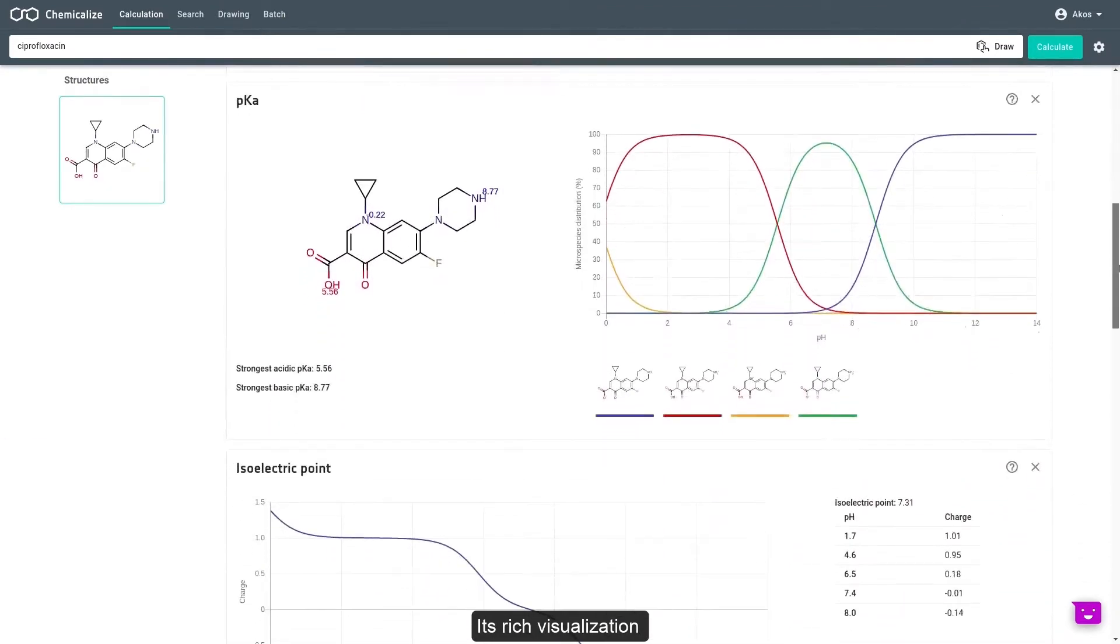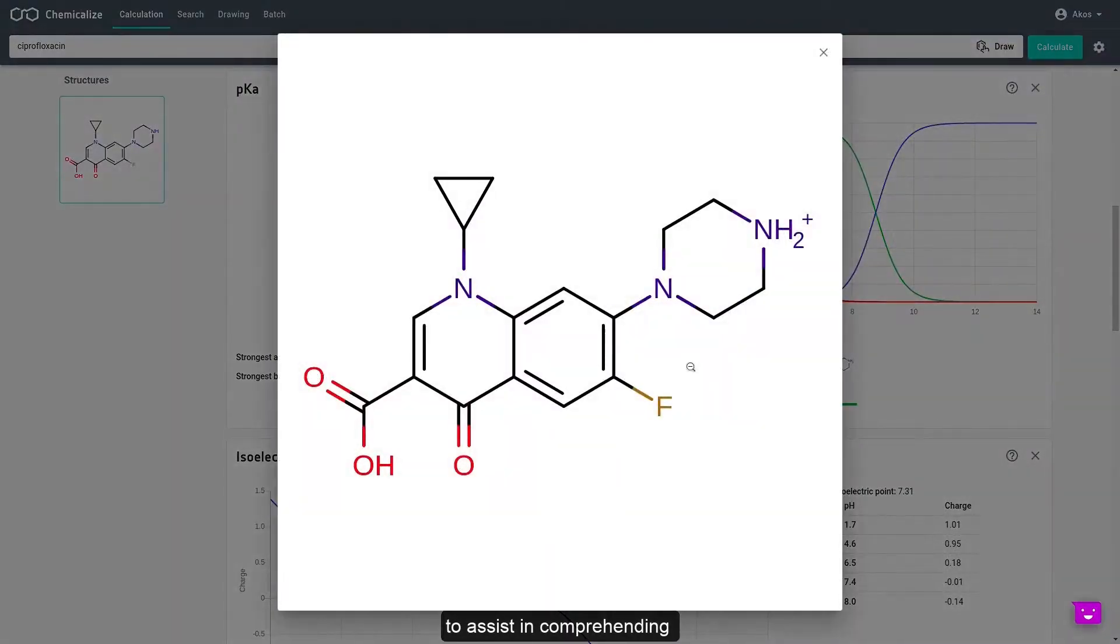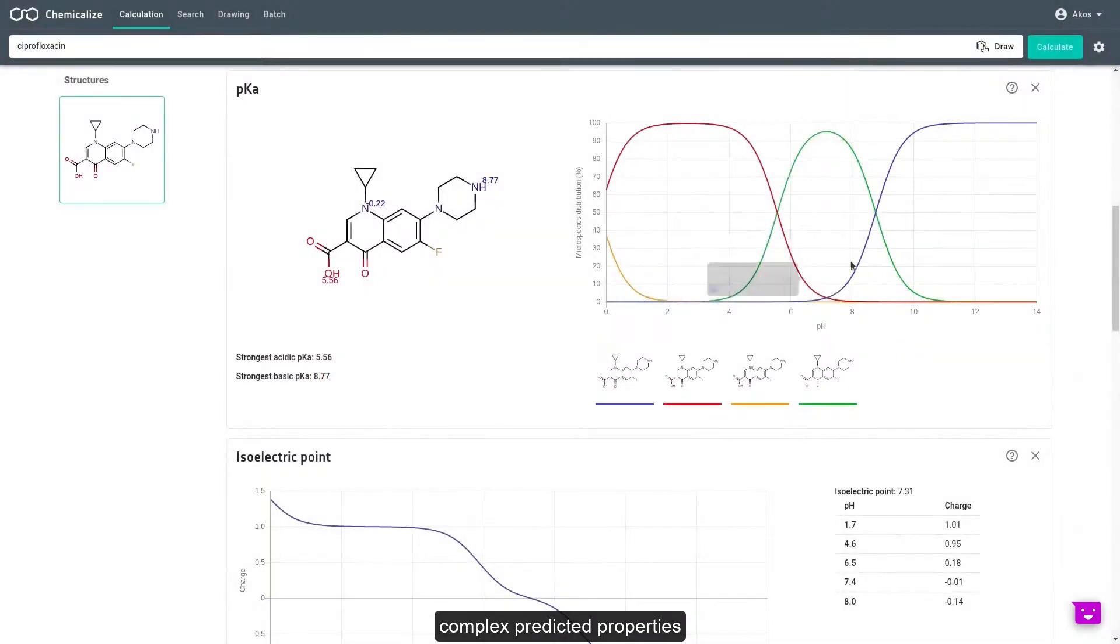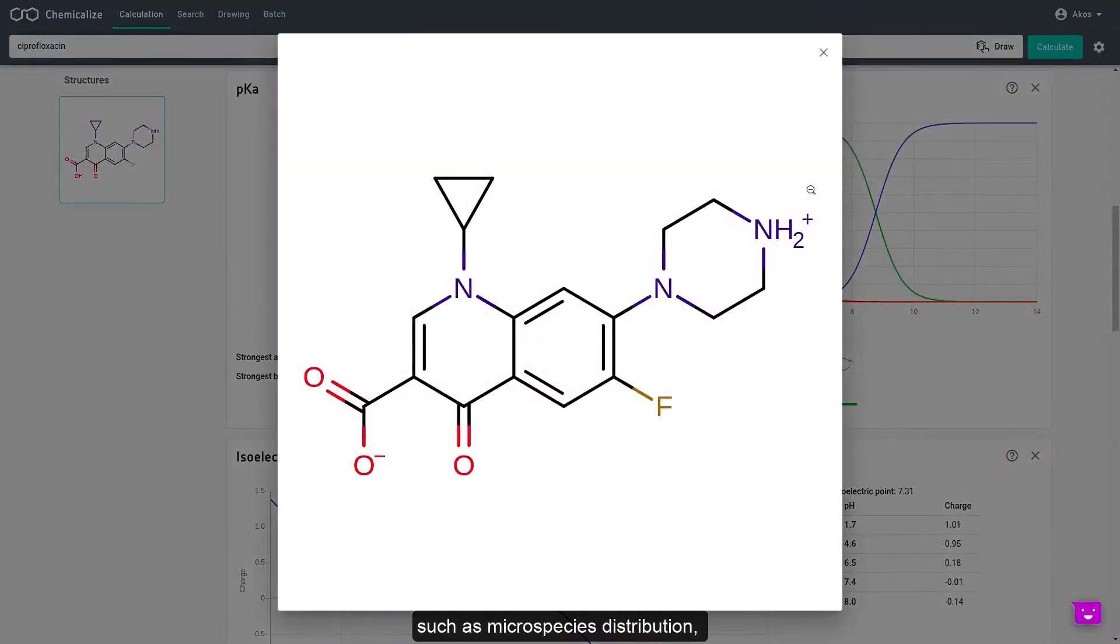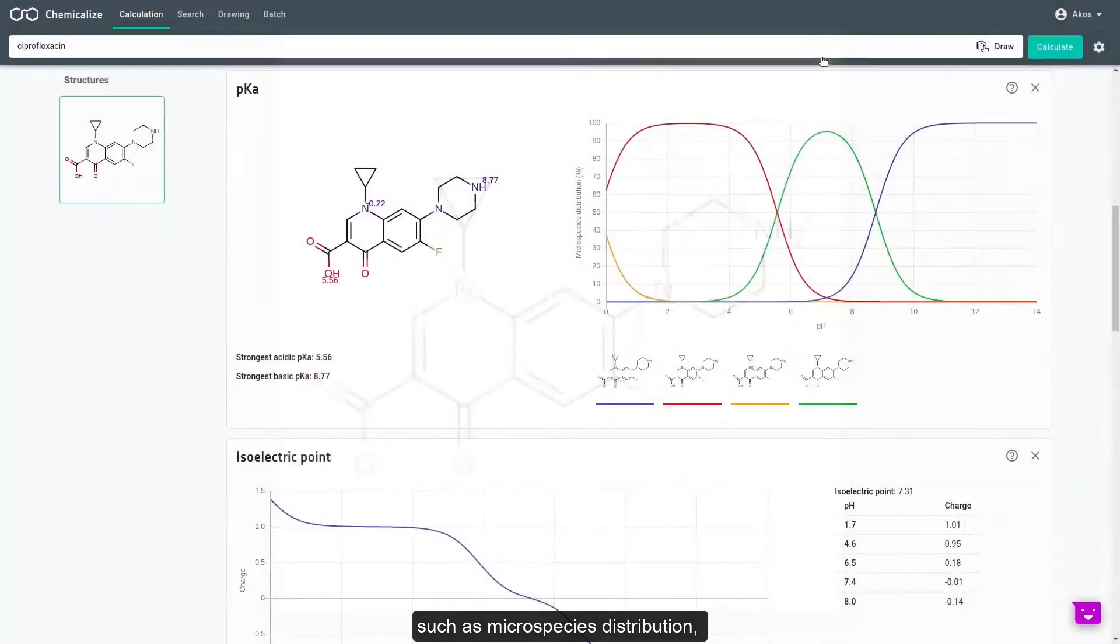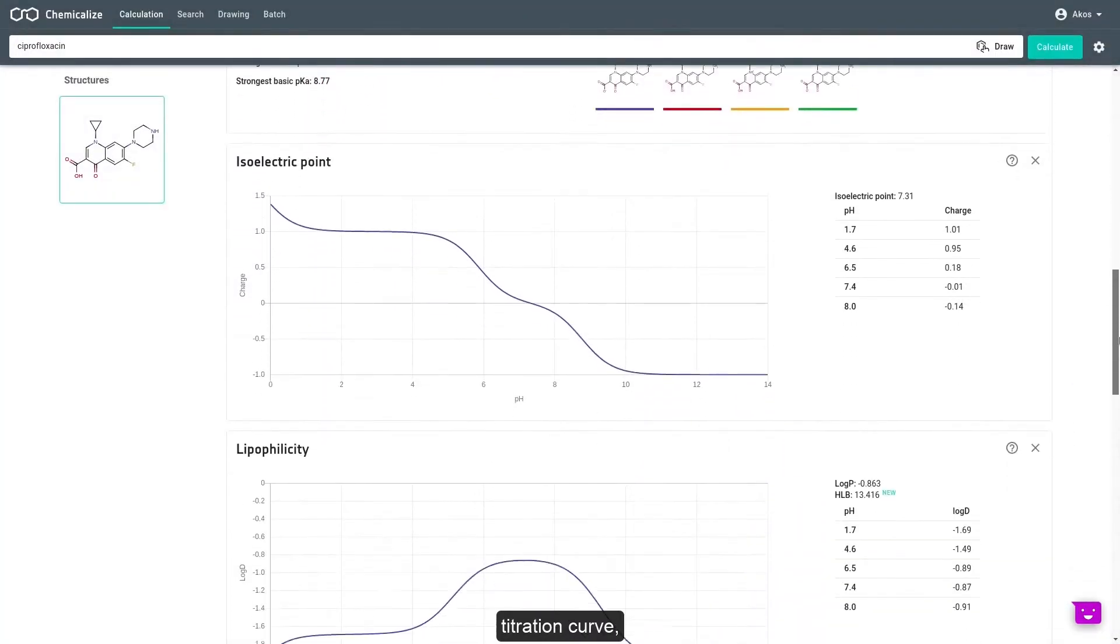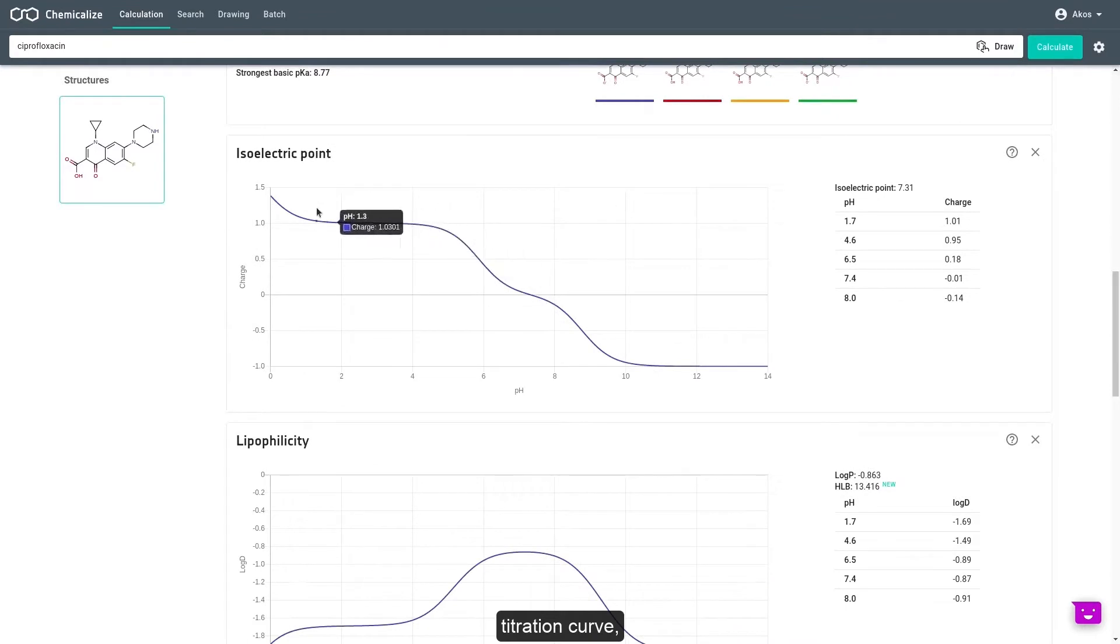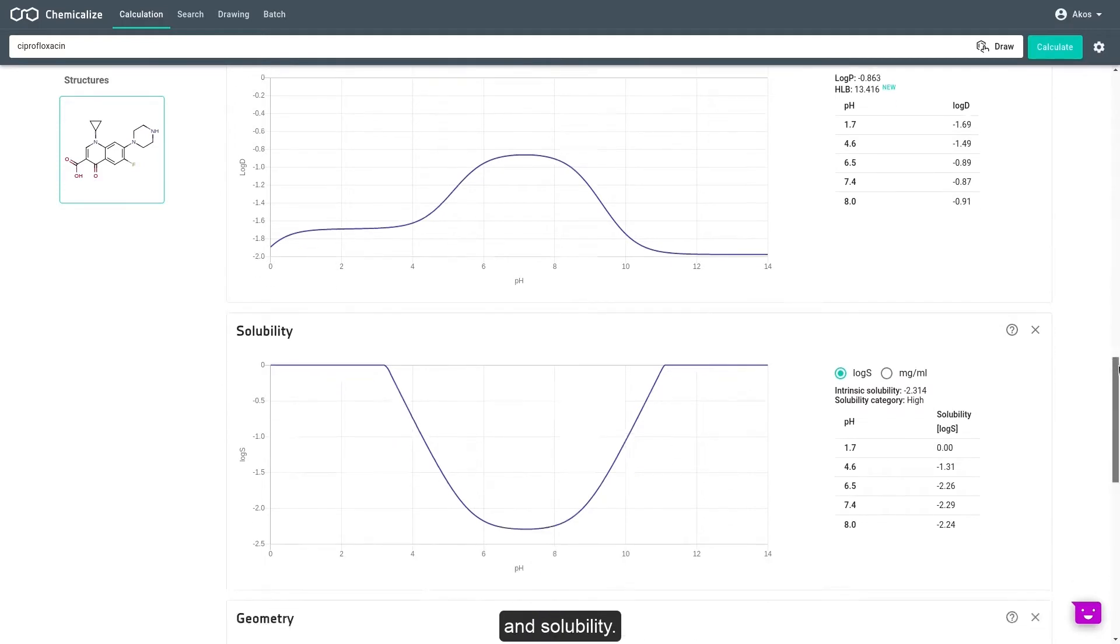Its rich visualization is designed and developed to assist in comprehending complex predicted properties such as microspecies distributions, titration curves, isoelectric point, pH-dependent lipophilicity, and solubility.